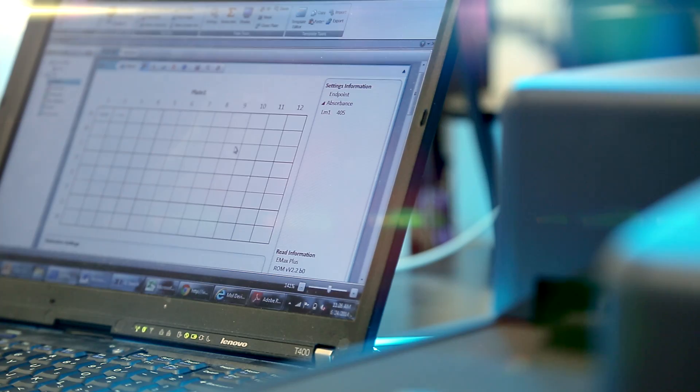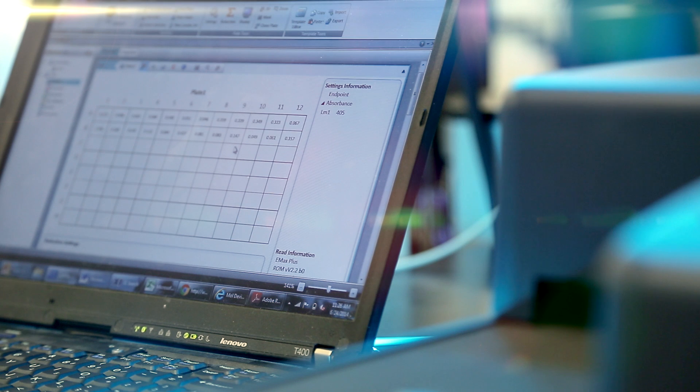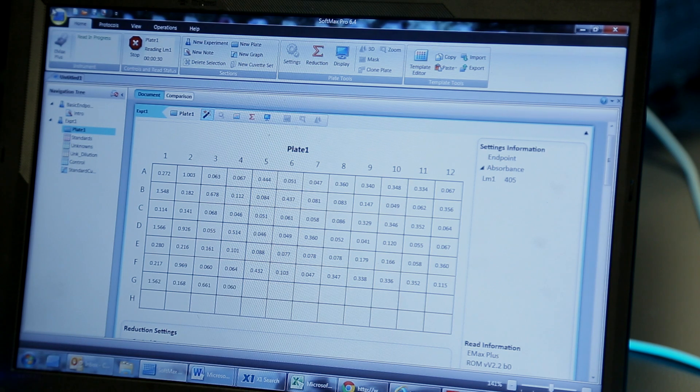The user simply selects the protocol they wish to use, loads the plate, and the plate is read. Data is acquired and analyzed immediately, creating a seamless workflow from plate reading to data analysis.